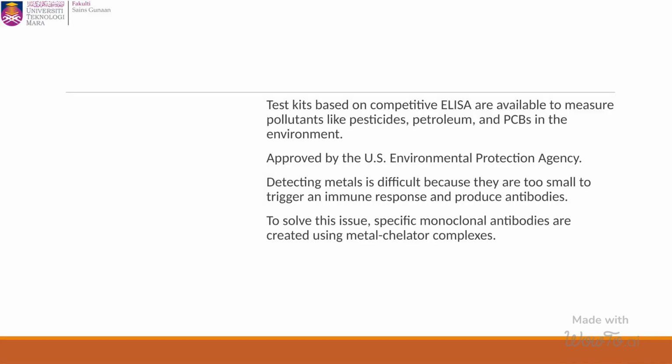Various immunoassay test kits based on the competitive ELISA are commercially available for measurement of organic contaminants such as pesticides, petroleum and PCBs in environmental samples. These kits are approved for use by the US EPA for detection and monitoring of these contaminants.